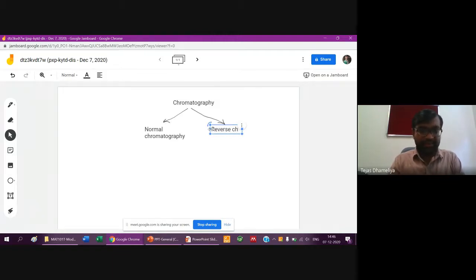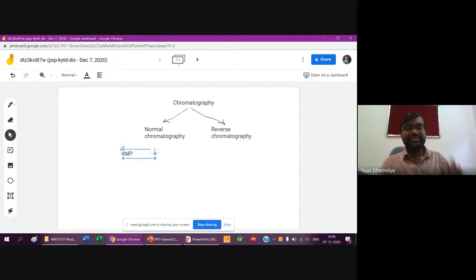तो आपने ये पढ़ा ही होगा, but since I am taking one chance to repeat the same thing, normal chromatography is a technique where we have two things, right? Chromatography में always two phases are available. One of the phases is called mobile phase, although it has nothing to deal with the mobile, but फिर भी उसका नाम mobile इसलिए रखा है because it can move, it is not static, it is dynamic. So that's why its name is mobile phase.